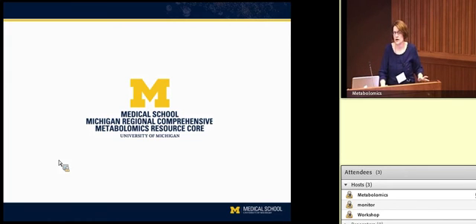I think it's more on a case-by-case basis. The analyst looks at it and says, okay, everything's shifted, but they've all shifted the same amount, 0.1 minutes in the same direction. On the untargeted platform, that's a little bit more of an issue. There's software that can go through and realign everything, and I'll talk about that. But for the targeted analysis, the internal standards are right there too. So you really have a peg on what that compound is, regardless of where it is coming out on the HPLC column. I don't know if that makes sense.